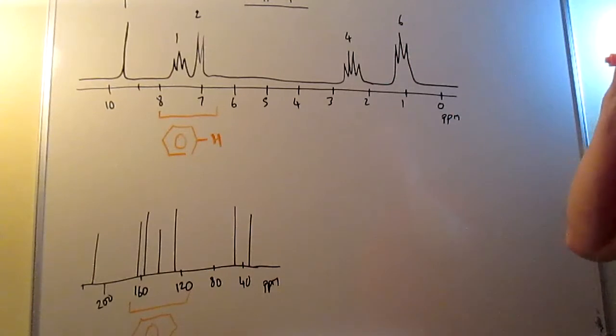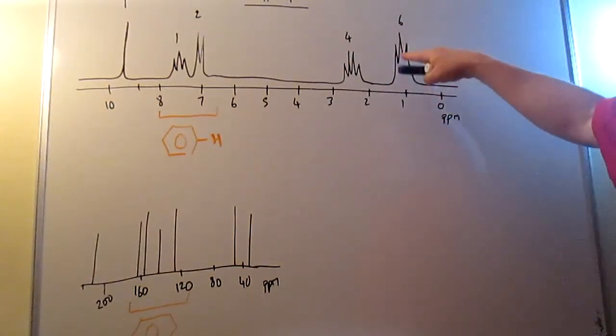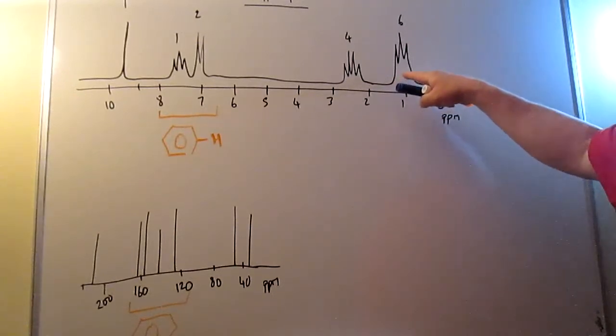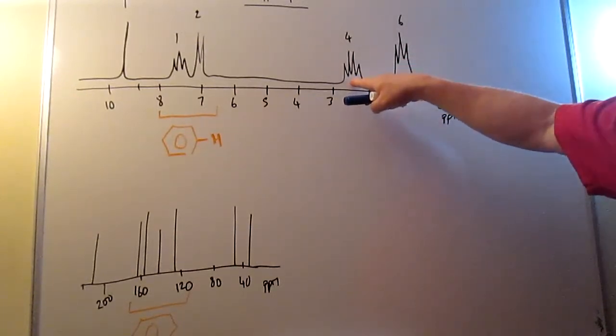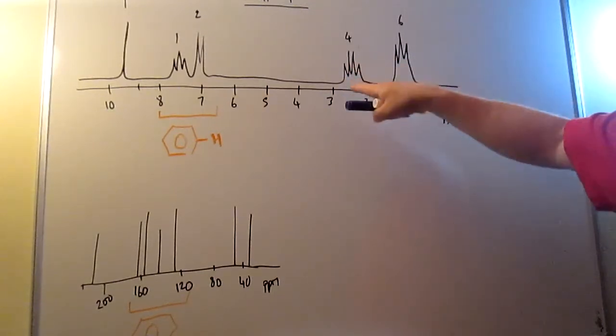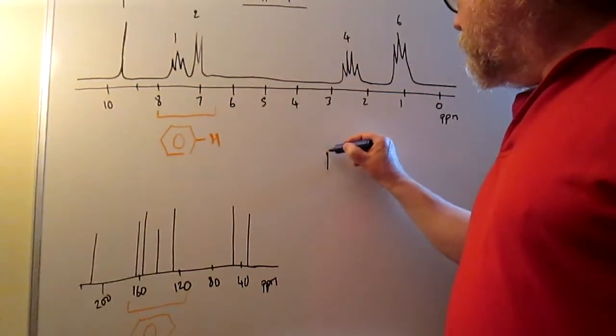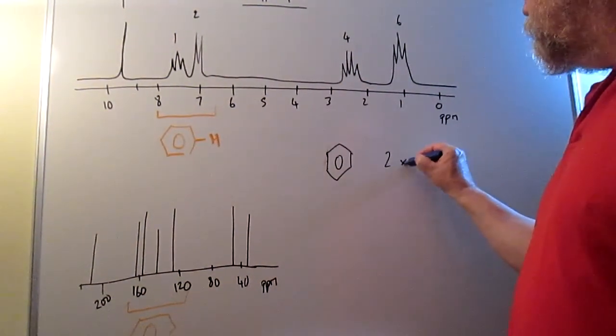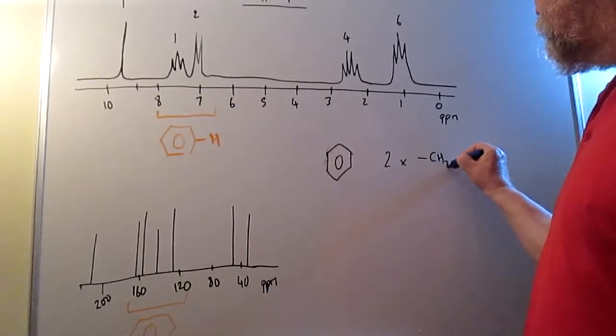And if you look at the chemical shifts, you can see that fits, because this one is just what you would expect for the methyl group. It's not attached to anything interesting, but if it's an ethyl group, the CH2 is next to the benzene ring, and that has the right shift. Okay, so far we know we have a benzene ring and 2 CH2, CH3 groups.